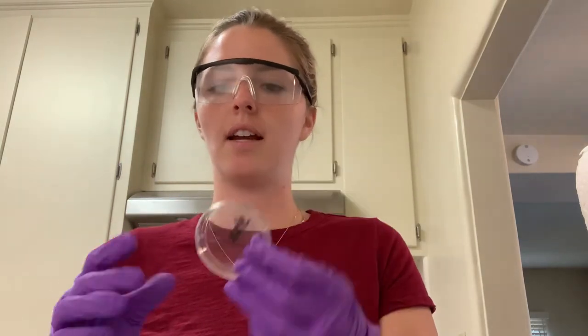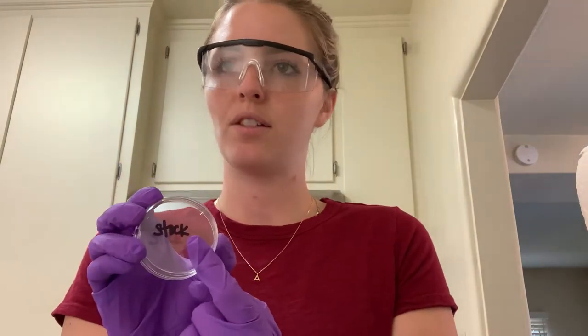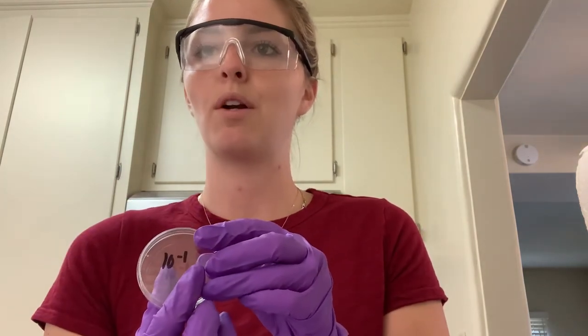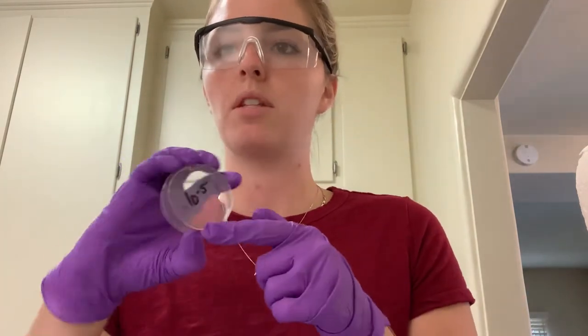First we're going to prepare our petri dishes. We have six petri dishes labeled and ready to go. You're going to label the first one as stock, and then the five others will be ten with an exponent of one, two, and all the way up to number five.